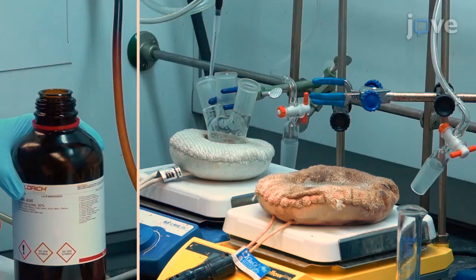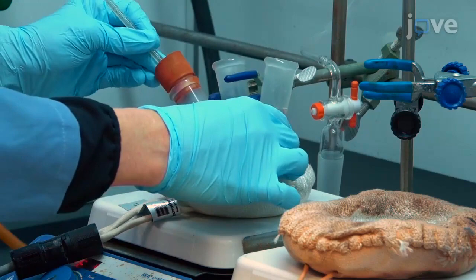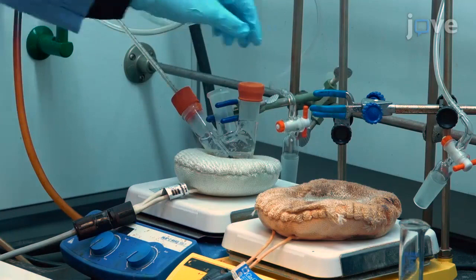Place a thermometer into one of the necks of the round-bottom flask via a rubber septum. Next, place a rubber septum into one of the remaining necks and attach the third neck to the nitrogen gas line via a schlenk line.